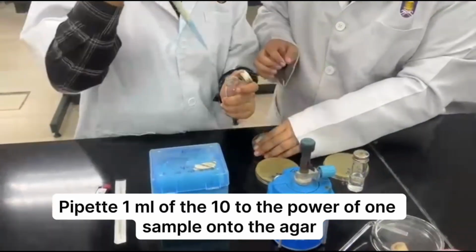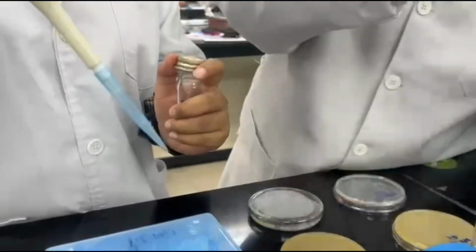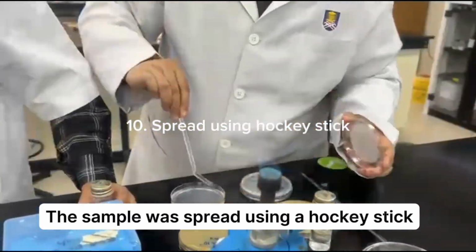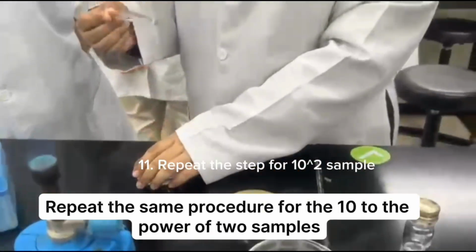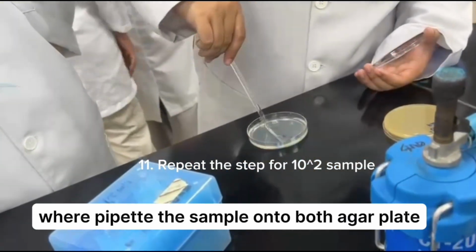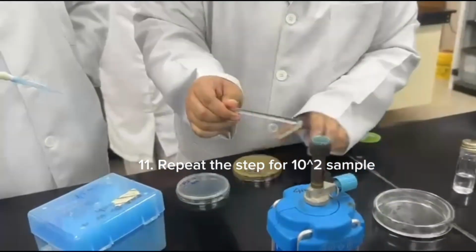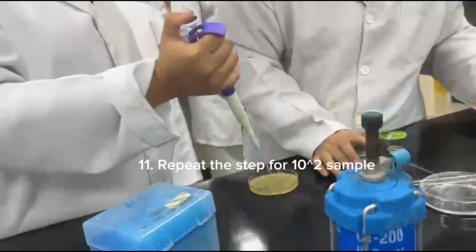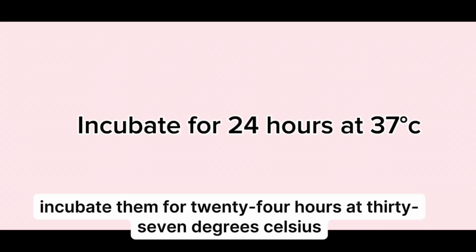Pipette 1 ml of the 10^1 sample onto the agar. The sample was spread using a hockey stick. Repeat the same procedure for the 10^2 samples, where pipette the sample onto both agar plates and spread them with a hockey stick. Incubate them for 24 hours at 37 degrees Celsius.